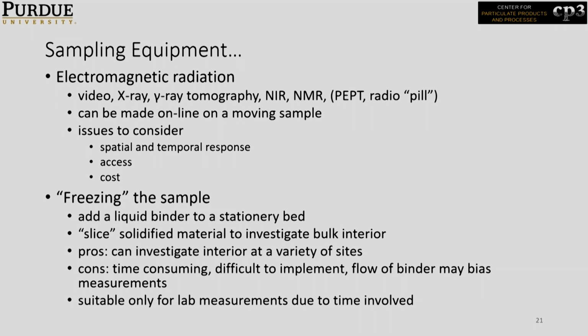Freezing a sample is another option. Again, these are mostly used for high value products. If it's very expensive, most common in pharmaceutical process. Even in the pharmaceutical industry, 1 gram itself is very high value, right? So they use these kinds of high end subsampling procedures.